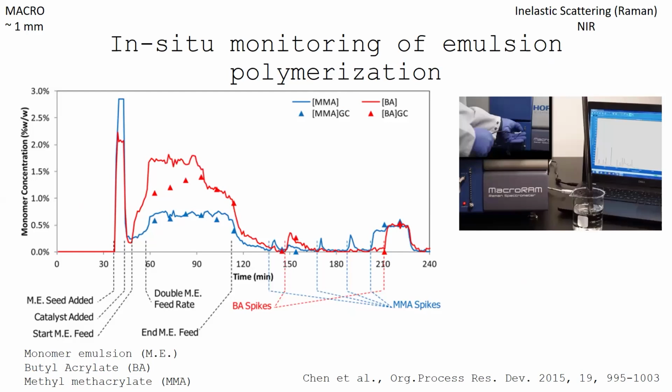And then my last macro example is we have a recently acquired tool in our suite of Raman spectroscopy capabilities. Raman is a form of scattering. So this is a scattered light interaction where it's actually inelastic scattering. So light changes energy after interacting with the sample. And that change in energy corresponds to vibrational state changes in your material. I assume you have some background in molecular spectroscopy because I don't have time to go through all of that.